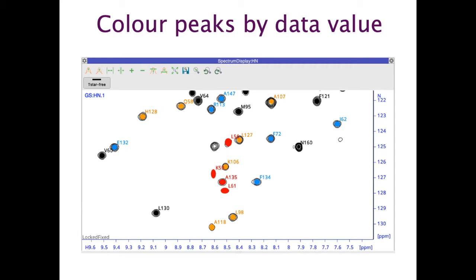So macros can be useful both as a means to help you in your everyday usage of the program, creating little shortcuts for things, but also for bespoke features, things that you might be interested in doing that probably no one else out there would necessarily be interested in doing. Now, of course, it's very easy for me to stand here and say, oh, you just write a little bit of code, and there you go, you've got your macro. Of course, you're thinking, how would I know which bit of code to write? Well, we've tried to make that process as easy as possible.